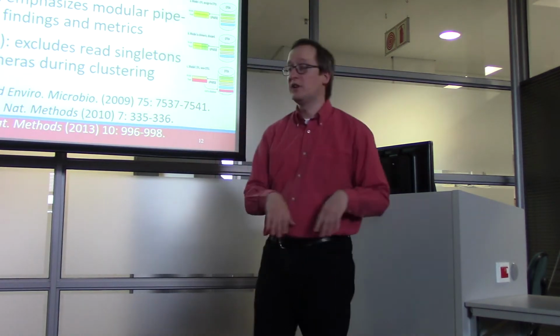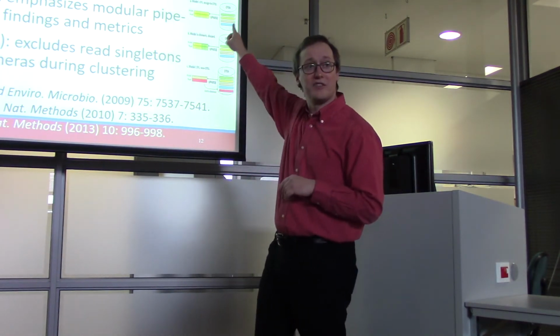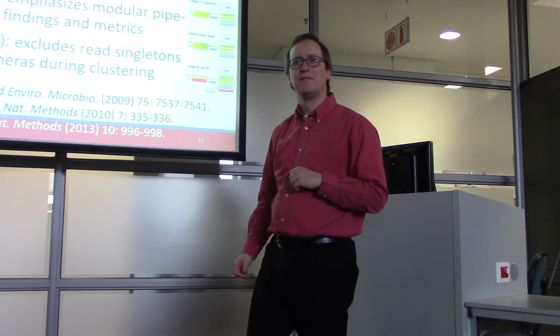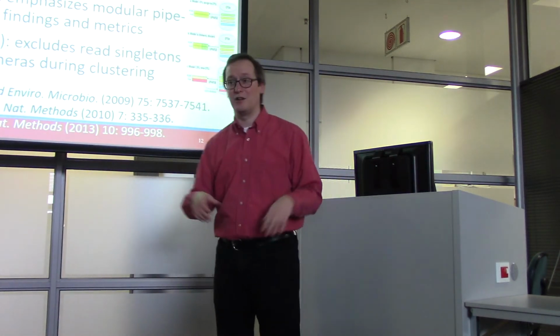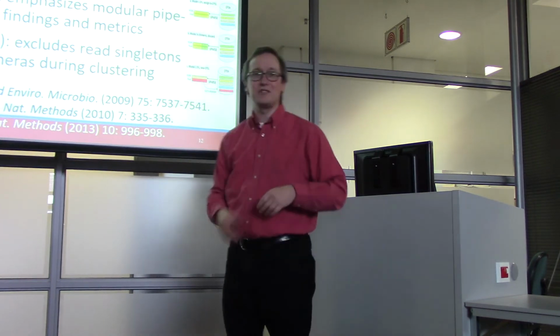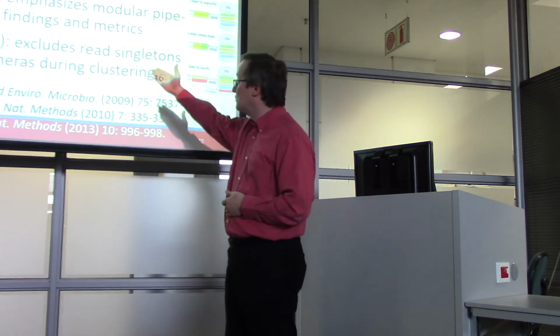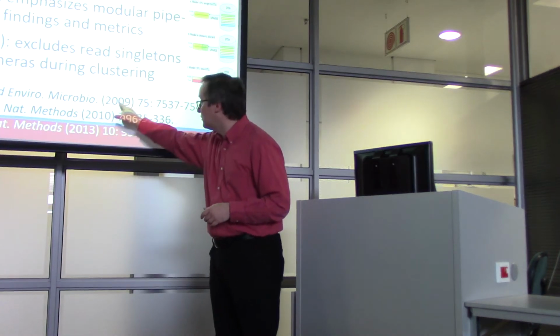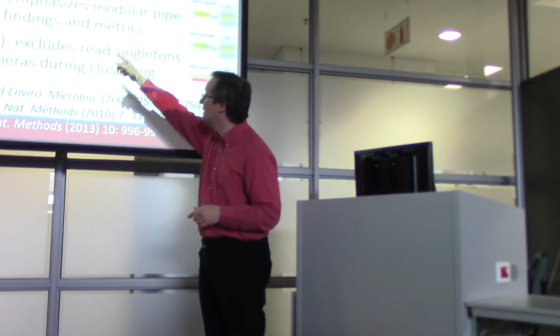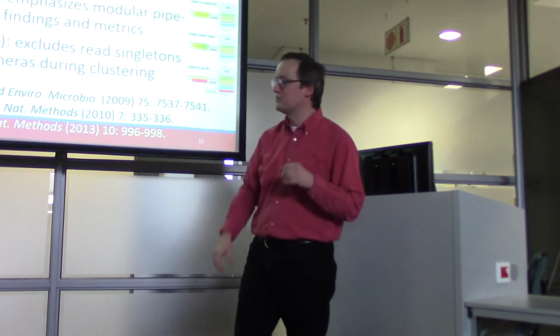Now, how do we feel about their graphic artist, though? See that logo at the upper right? That's QIIME. First off, how many people knew before today that it's pronounced QIIME, like chime? QI does not always strike everybody as being a chai sound, but there you go. So that's QIIME. Their tool set is available right there. I've given the citations right down here at the bottom. So the 2009 paper is Mothur, 2010 is QIIME, 2013 is UPARSE.